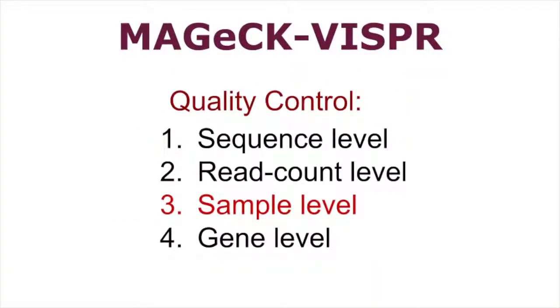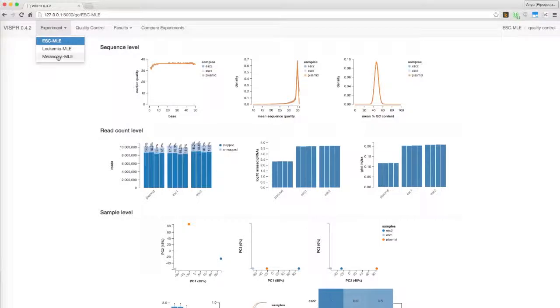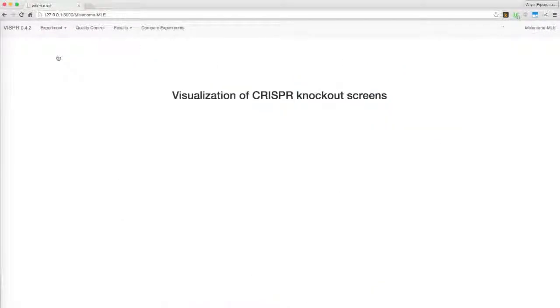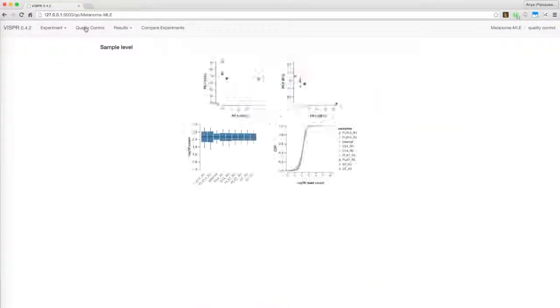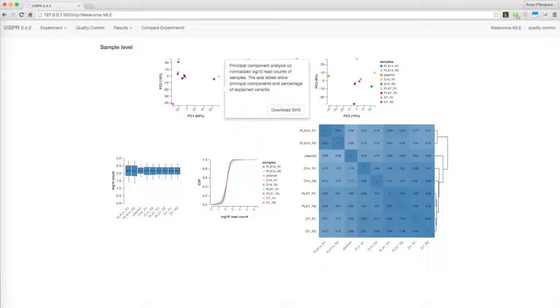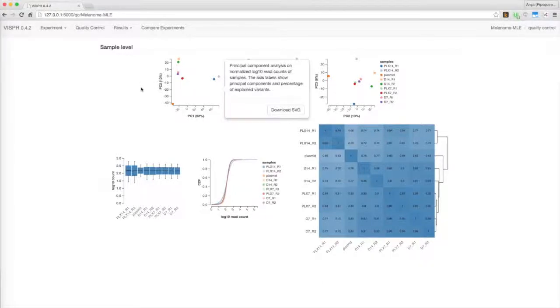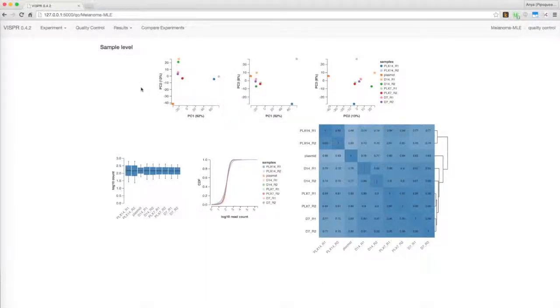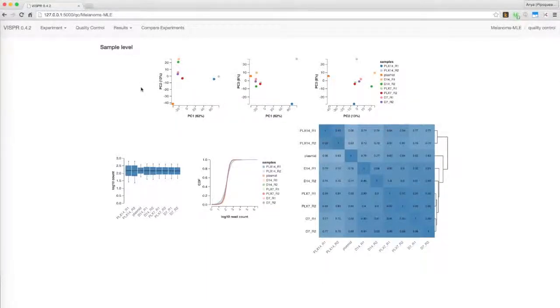Sample level quality control checks the consistency between samples. For this, we'll switch to the melanoma dataset which provides a better example. Here, Vispr draws the samples on the first three components of a principal component analysis. You can see that the replicates are clustered together, indicating consistent results.